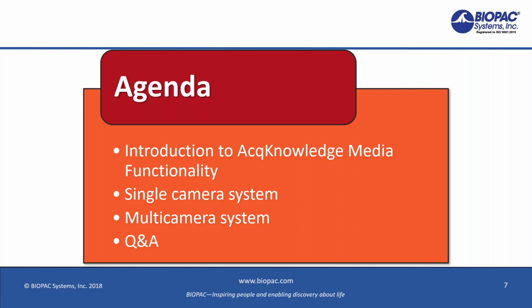For the purposes of this webinar, I'm using human subjects, but this can be done whether you're using animal or human subjects, it really doesn't matter. I've got a very willing volunteer, Sadaf, who's going to be joining us a little bit later on. I've got her set up and we'll be running through some of the video collection and synchronizing it with her physiological signals.